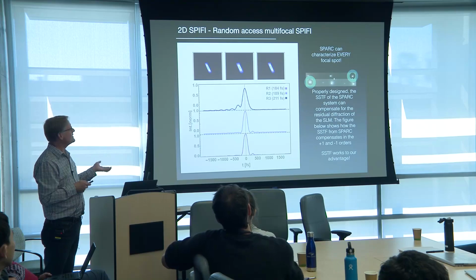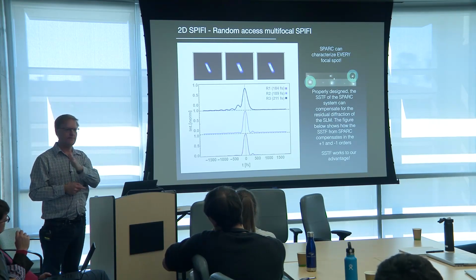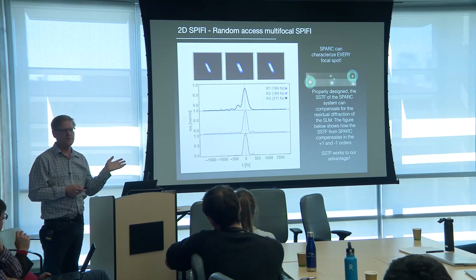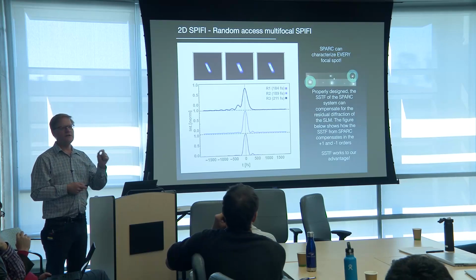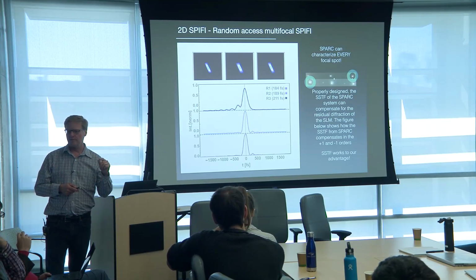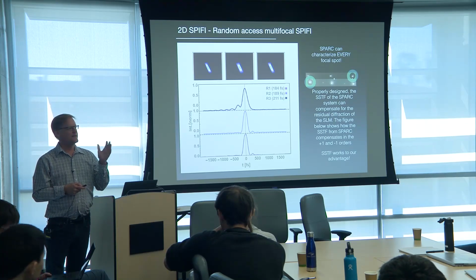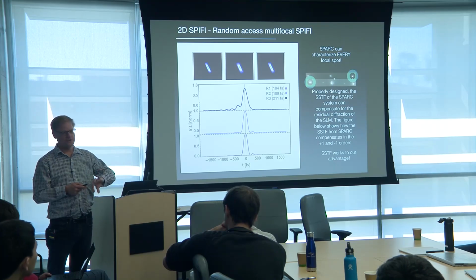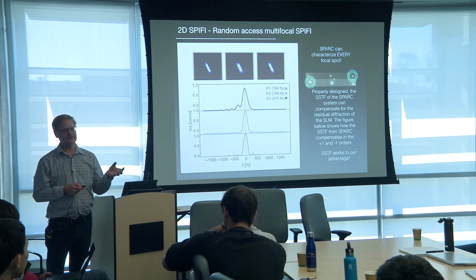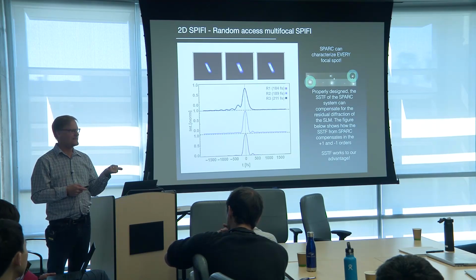Now what happened serendipitously is we realized we're really using all the orders. Most people don't do this when they set up SLMs like this. But remember, in our spark system, the beam has a mild spatial chirp on it. The SLM is creating a spatial chirp. So we can rotate the spatial chirp of the spark system to negate the effects of the SLM.